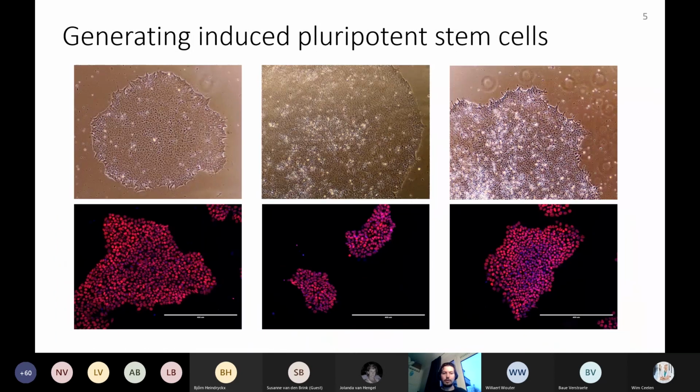If you then continue, on this slide you can see that we have now established several Marfan syndrome iPSC lines. Of course, we have to do many characterizations to make sure that everything is correct. One of those characterizations is checking whether they are still pluripotent. In this slide, I show a NANOG staining, and NANOG is a pluripotency marker indicating that these lines are pluripotent stem cell lines.